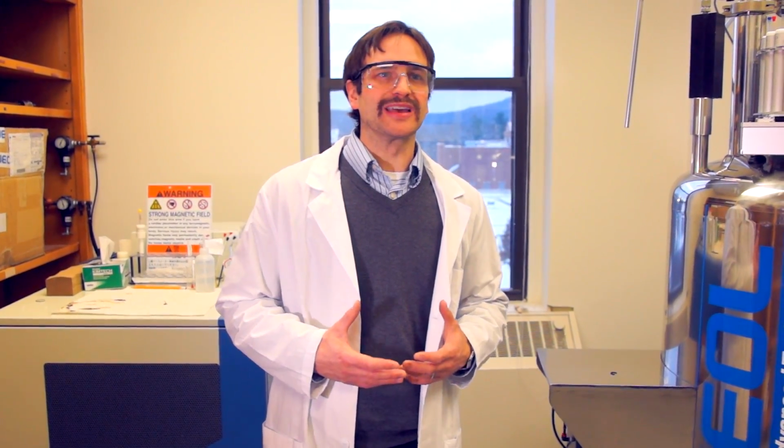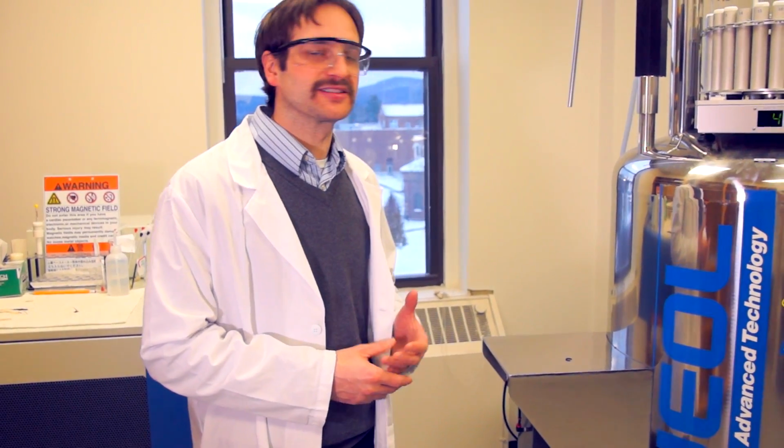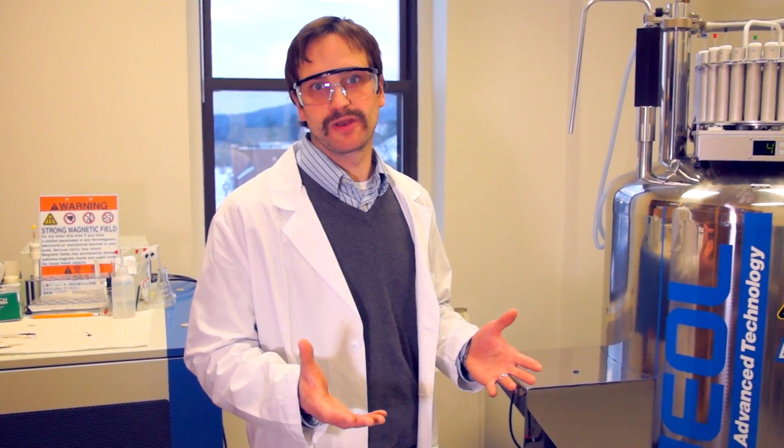Hey everybody, now what I'd like to do is tell you a little bit about the instrumentation that's in this room, which is NMR, which stands for Nuclear Magnetic Resonance. NMR is a very similar theory as what many people know as MRI in hospitals. The idea is that you excite a particular molecule and then you can visualize the excitation and then the relaxation of that excited molecule. NMR is a little more powerful. The nuclear magnetic resonance that we're dealing with deals mainly with hydrogen atoms and sometimes carbon atoms, although other atoms are possible as well.